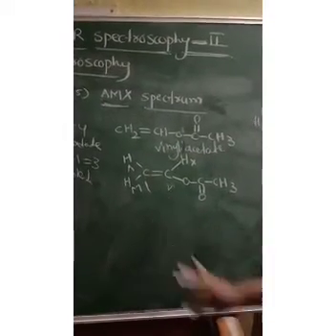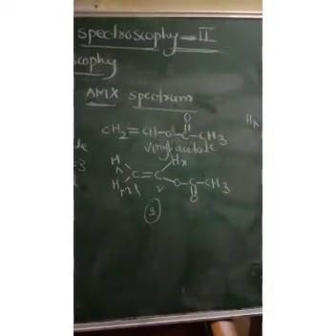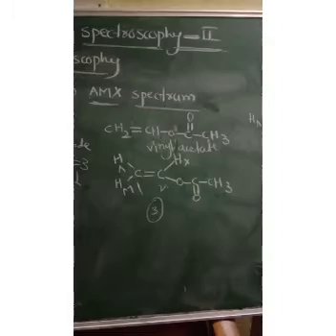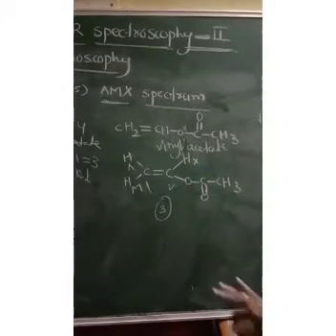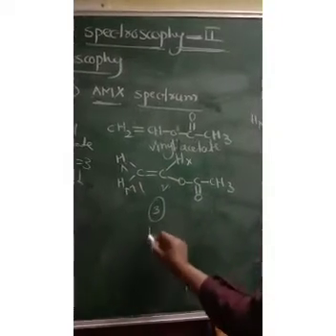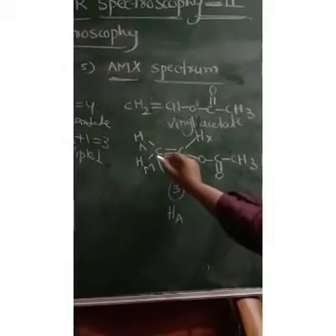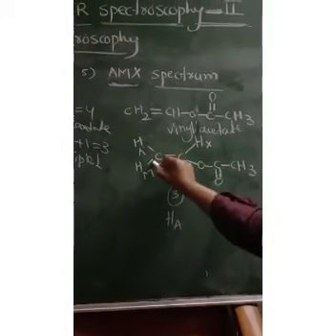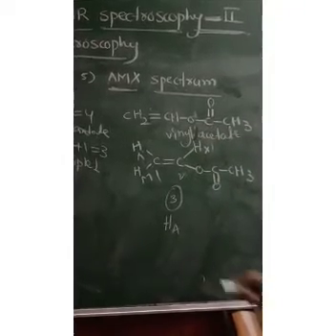So for this molecule, there are again 3 signals in the spectrum, but the coupling is completely different. For the A type of proton, HA has an adjacent HM proton and an adjacent HX proton.